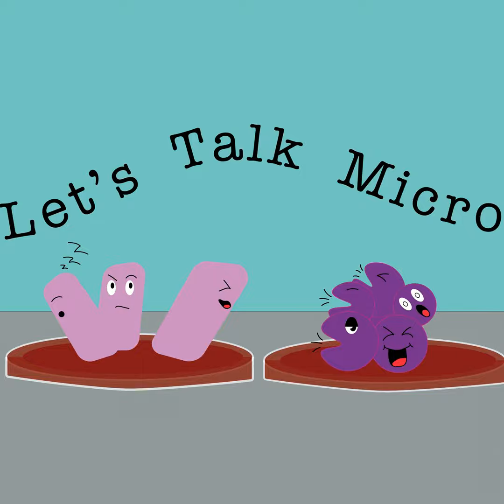And for you students out there, these are very typical questions when you're doing your clinical rotations. I have mentioned that I dabble in teaching, and I like to ask these questions as well. If you have a Klebsiella that's indole positive, what's the species? Then you will say Klebsiella oxytoca. And if it's indole negative, Klebsiella pneumoniae.